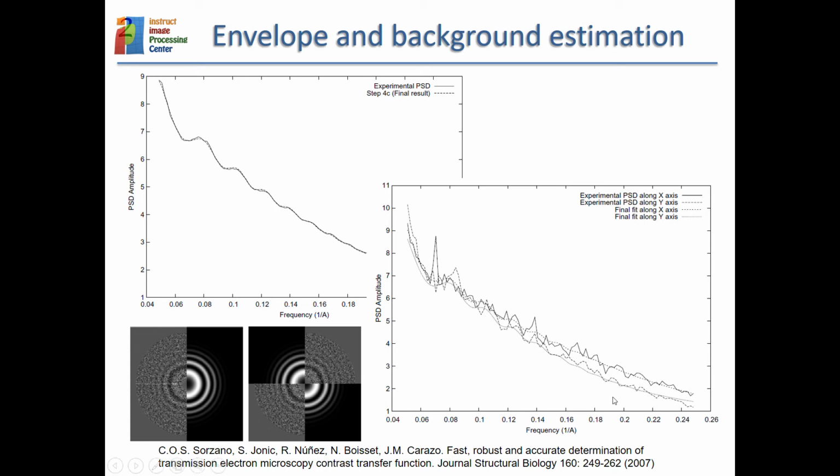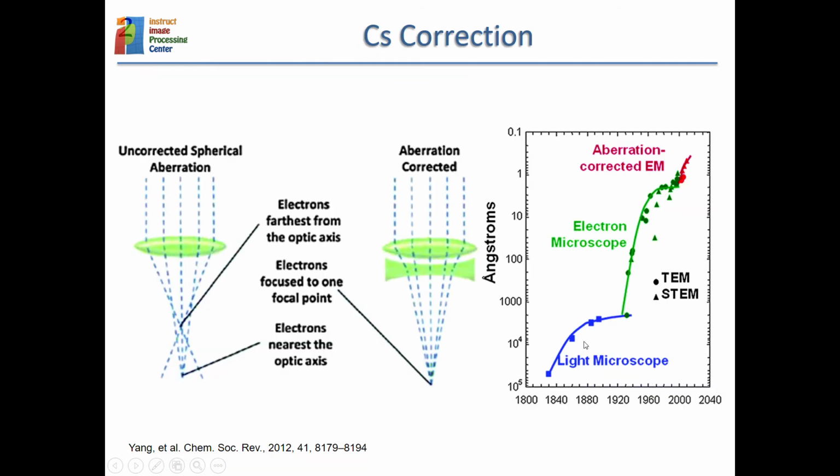But it is also that the noise underneath is astigmatic. So it is not only that the defocus is astigmatic, but the noise is also astigmatic. And then you need some way of estimating this astigmatic noise shape. So all these tools that only work with 1D radial averages might be missing the astigmatism of the noise.